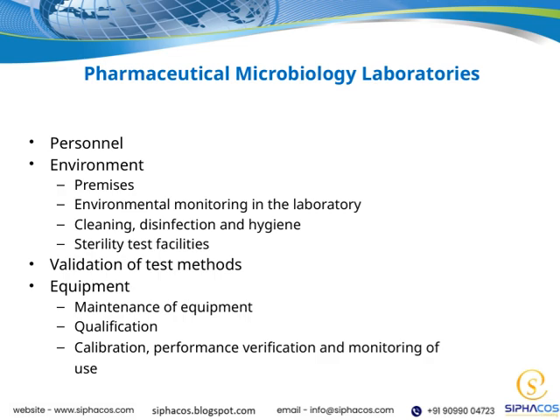Turning to equipment, its maintenance, qualification, calibration, and performance verification are essential steps. Regular maintenance keeps equipment functioning optimally, while qualification and calibration ensure that our instruments produce precise, accurate results.